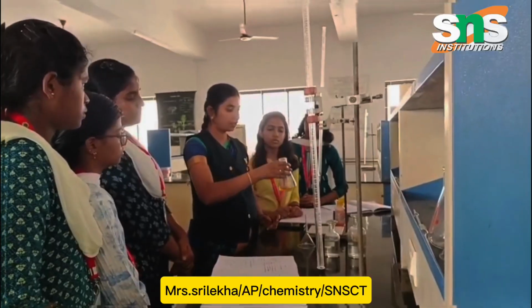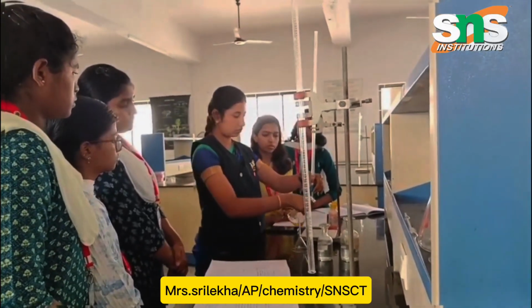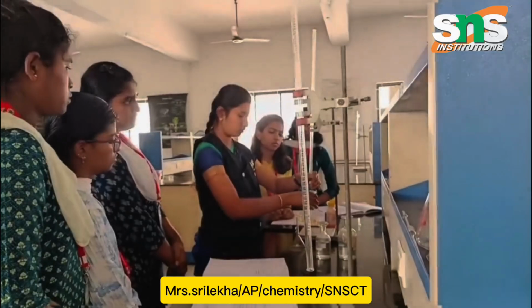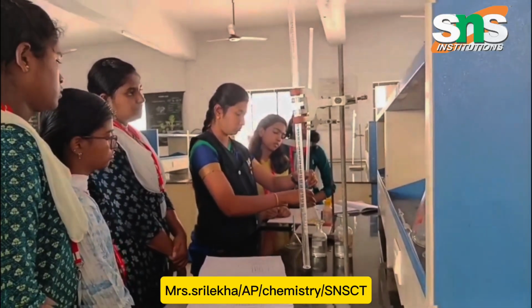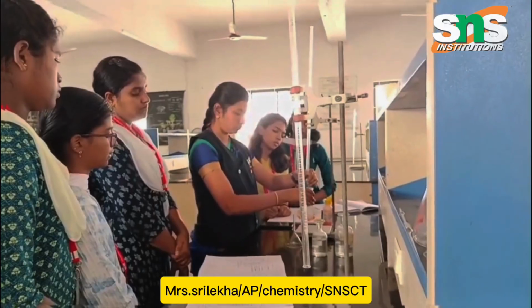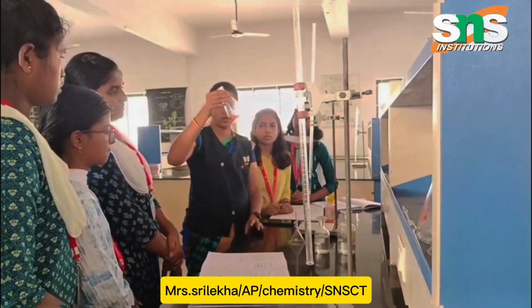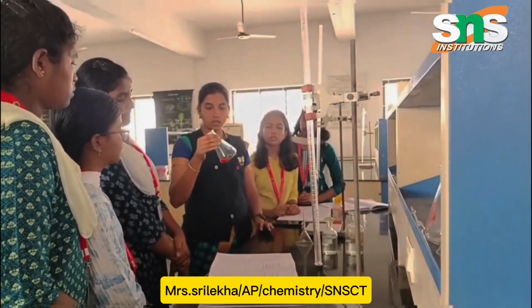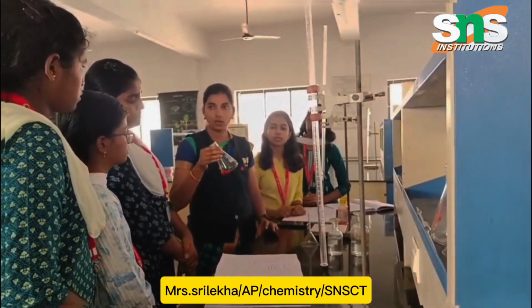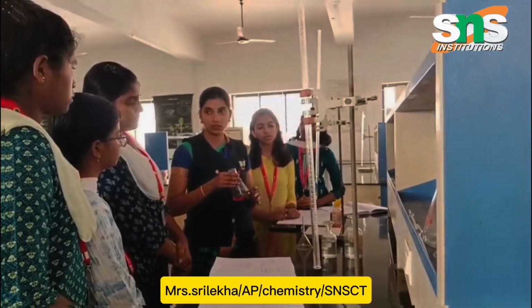Again titrating with the same burette solution, we have to make it reddish orange. The solution turns from yellowish to reddish orange. This is the end point of the reaction, showing whether hydroxide, alkalinity or carbonates are present in this water sample, using phenolphthalein and methyl orange.